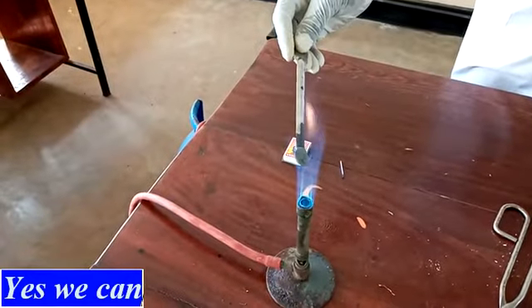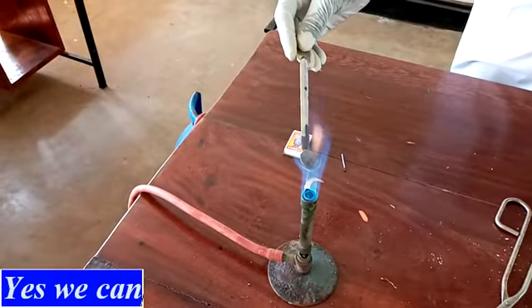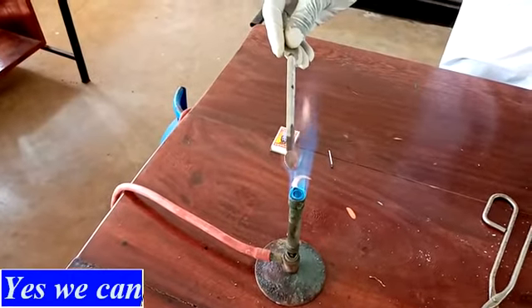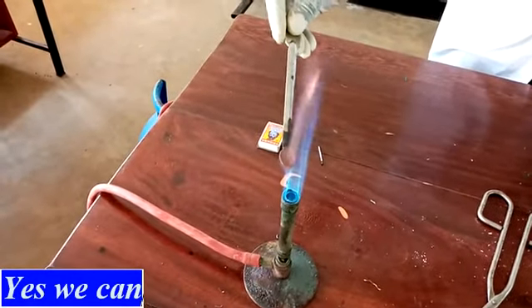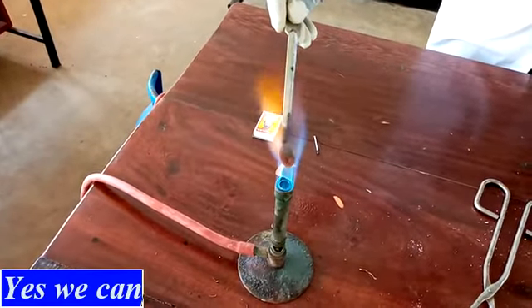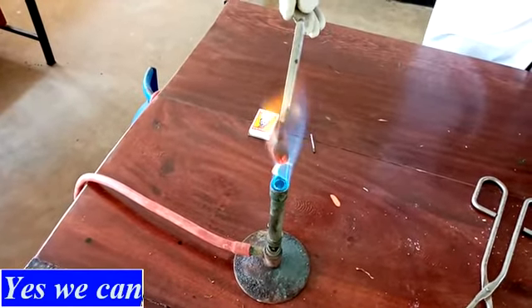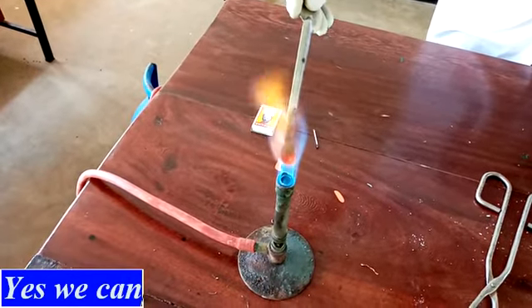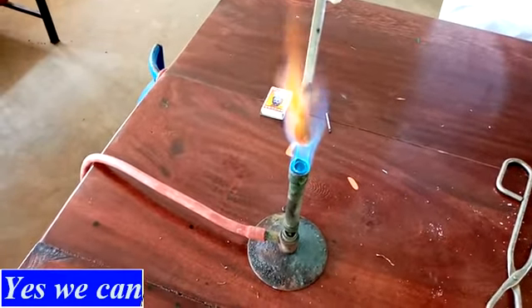Beautiful. So you have to look critically at the product and note its color. Note the color of the product there. So this product here has a different color when it is hot and a different color when it is cold.